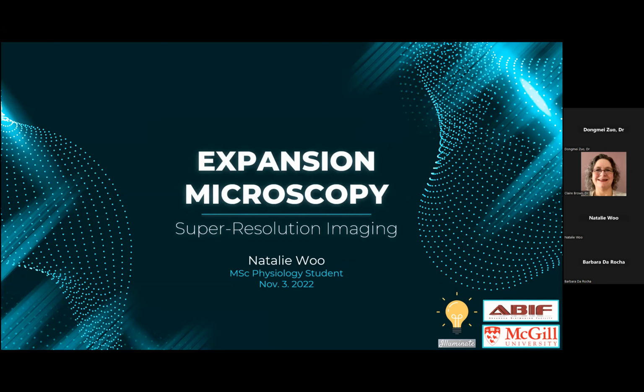So yeah, as Claire said, I'm going to be talking about expansion microscopy and how it can be used for super resolution imaging. So I guess just a show of hands, how many of you have heard about expansion microscopy? Okay, few. And how many of you have tried it before? Okay. And for the virtual audience, if you want to put it in the chat as well.